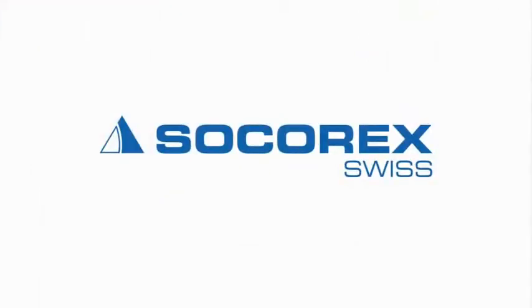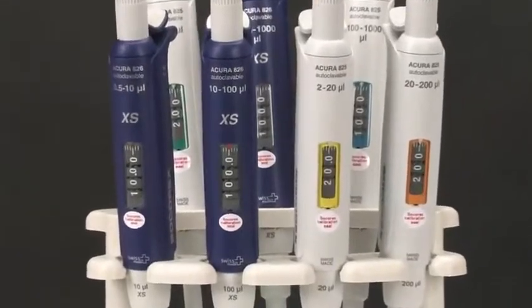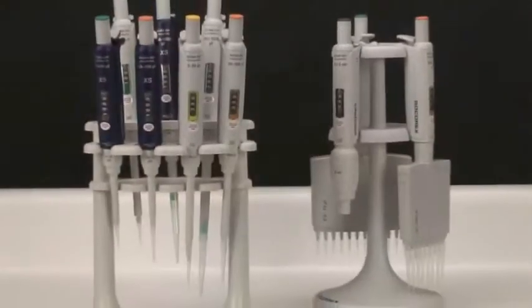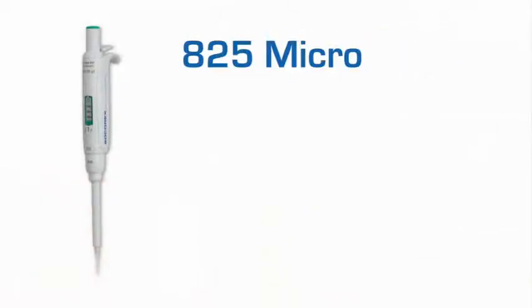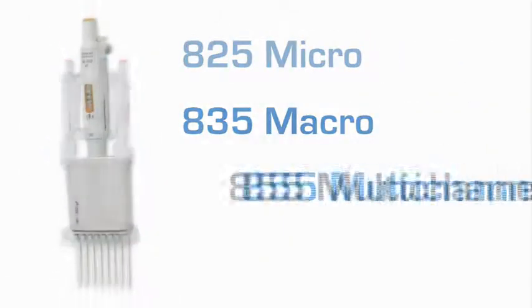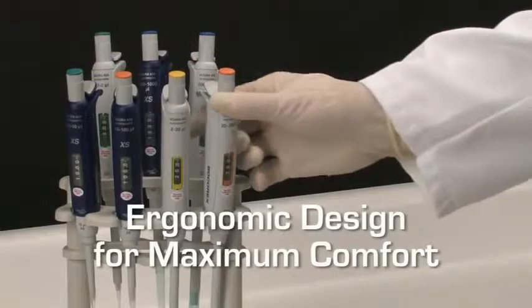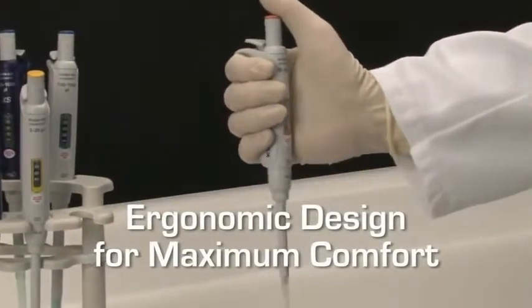Socorex Acura Manual Pipettes. The Acura series of variable volume pipettes from Socorex offer a wide selection of high precision solutions to meet the exacting demands of your specific liquid handling application. Available in the well-known 825 micro, 835 macro and 855 multi-channel models, and introducing the new 826 XS model for enhanced performance and research applications, Acura Manual Pipettes are designed and engineered to be comfortable and user-friendly as well as easy to maintain.